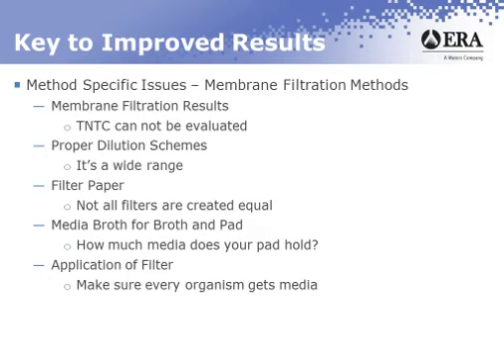Application of filter. It's really important that you get good contact between the filter where your organisms are seated and the pad that has the absorbed nutrients. If you don't make a good contact between those two, there's no nutrients for your organisms. So you need to put it on very carefully. Generally, what's recommended is to get maximum contact as you roll it from one edge to the other. So you take one edge, you put it on the pad after you put your media on, and you slowly roll it onto the pad, making sure that you don't trap any air underneath it.